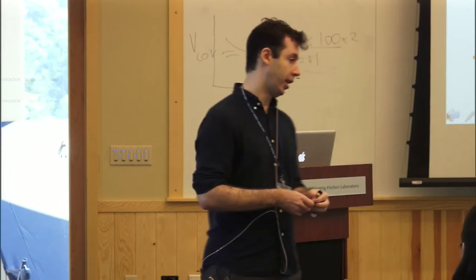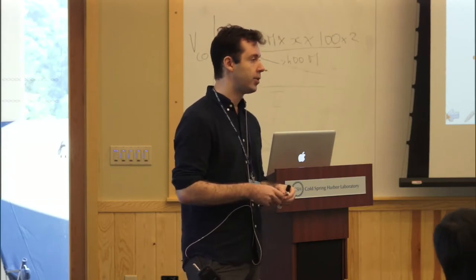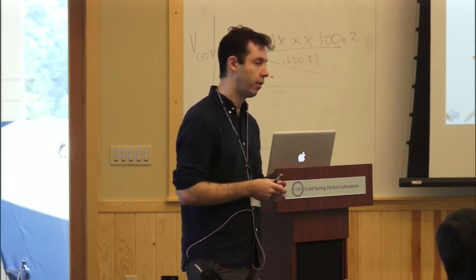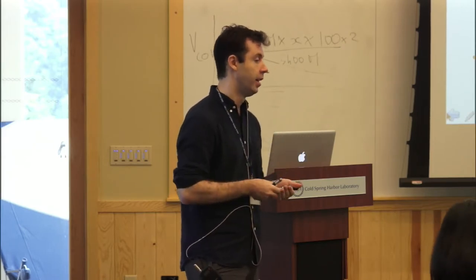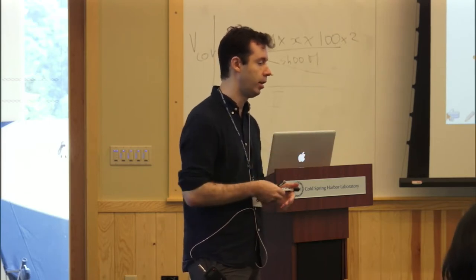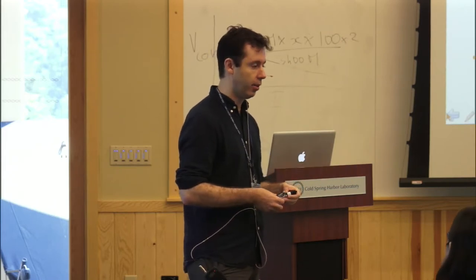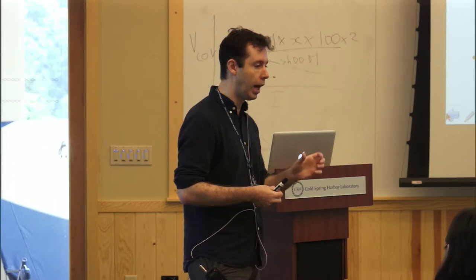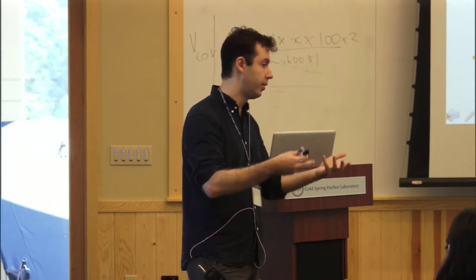Certainly not saying that it's perfect. You definitely have to be very careful. So I would say this is a situation where you would benefit from longer reads, even paired reads actually, that would allow you to map more of your reads, especially these reads that are a bit tricky. Obviously everything we're discussing in terms of mapping these reads that are ambiguous doesn't really apply if you are interested in a problem that involves repeats in the first place.